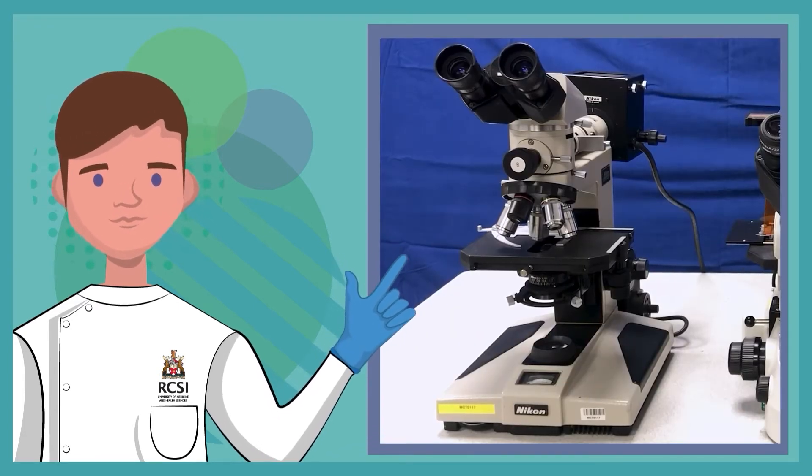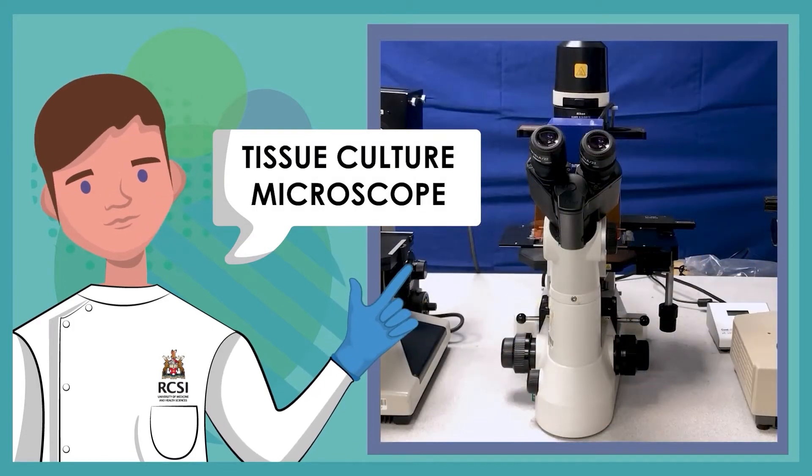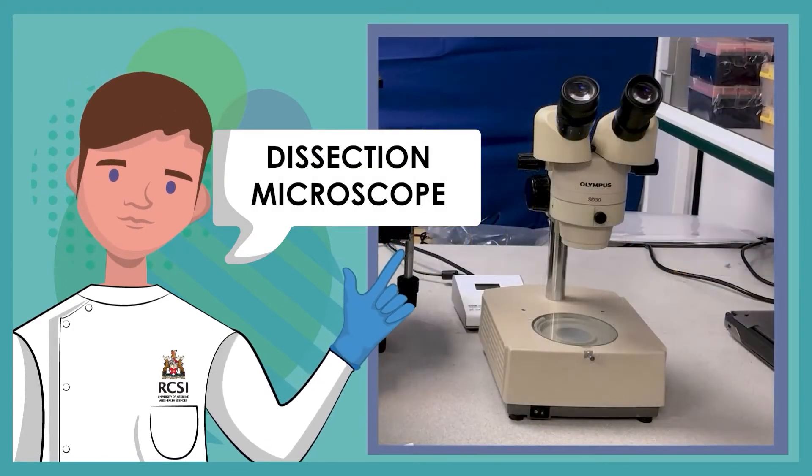These microscopes from left to right include the fluorescent microscope, a tissue culture microscope, and a dissection microscope.